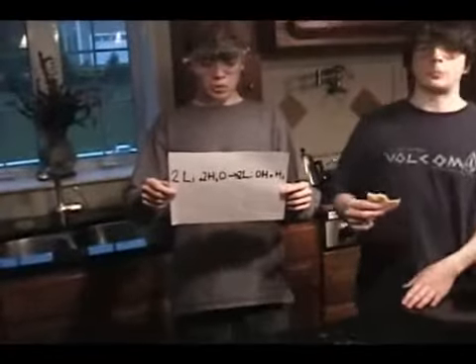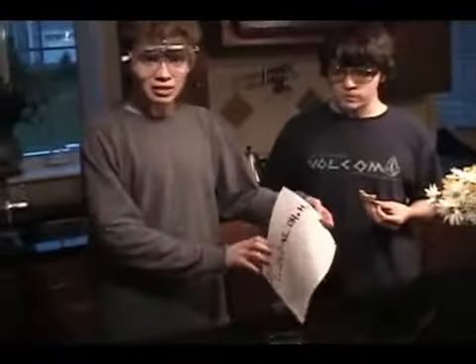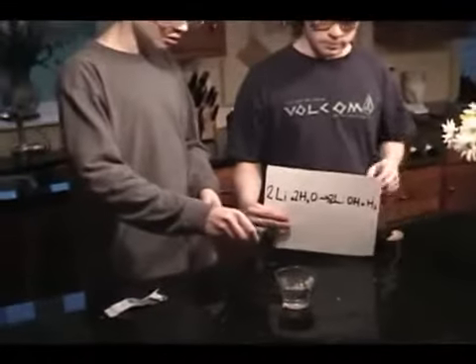Today we'll be combining lithium with water to create lithium hydroxide and hydrogen gas. Hold it. Okay. 3, 2, 1.